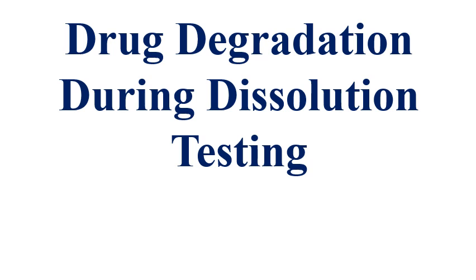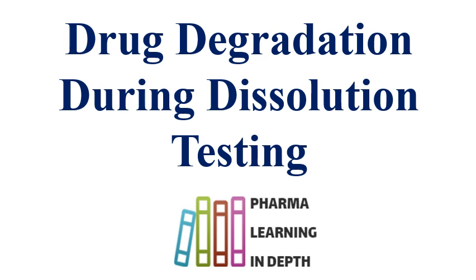Drug degradation during dissolution testing. This is the topic for the present video, and the topic is important because if the drug gets degraded after release in the dissolution testing, then dissolution testing will not give you accurate results.